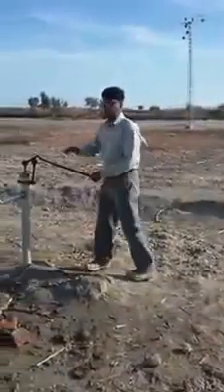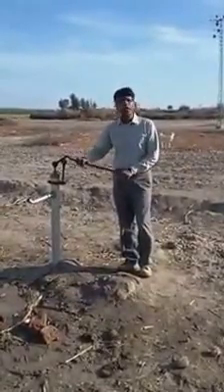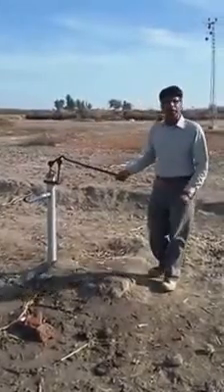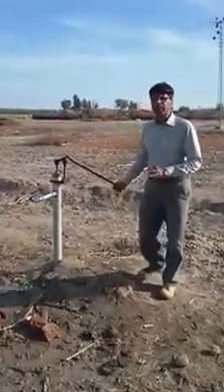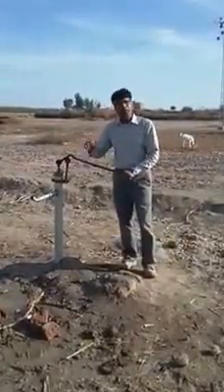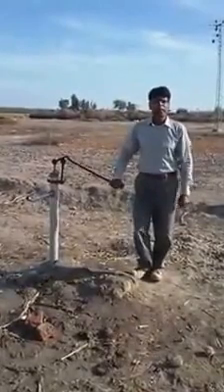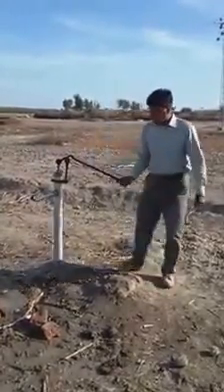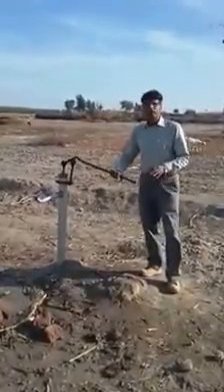This hand pump is installed at 85 feet below the soil surface and the bore depth was kept at 90 feet. We found the water table at 7 feet below the surface, and after that, at every 10 feet depth, we collected soil and water samples. We checked the TDS of that water using a Blue Lab combo meter to assess the water quality at each depth.